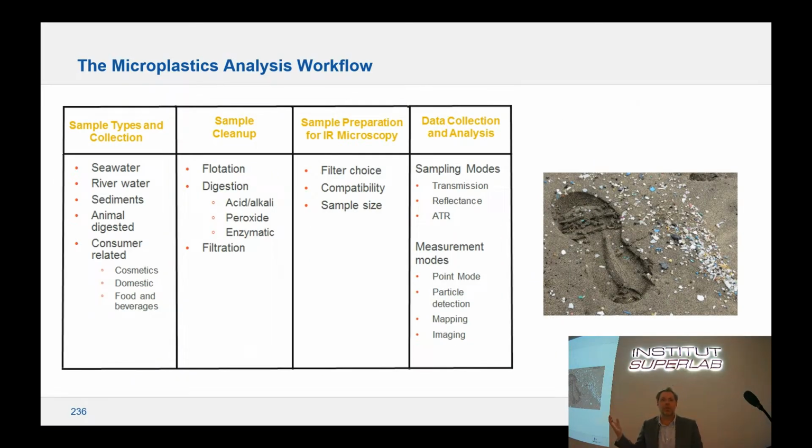So this is the entire workflow. Obviously, you begin by collecting the samples, then you clean them up in some way, do some pre-processing. I saw some of the presentations this morning. Forgive me, my Serbian is not great, but I did work out from the conversations earlier and from the slides that actually we've already gone through a lot of the cleanup already. You filtrate, and then you do your analysis on that filter. You can actually remove microplastics from the filters and put them onto some ways of analyzing in the infrared as well, but you might lose samples there. So typically it's done on filters.